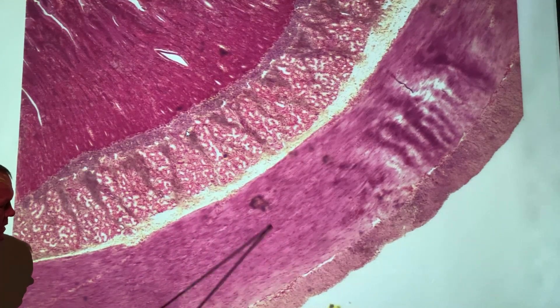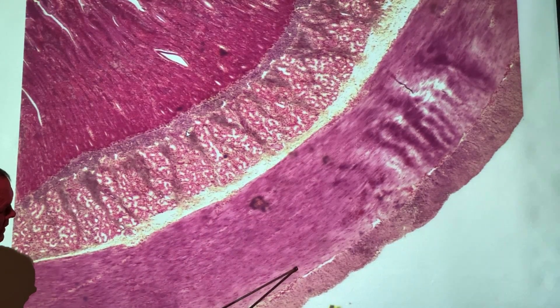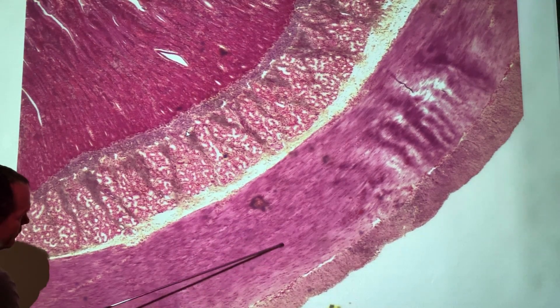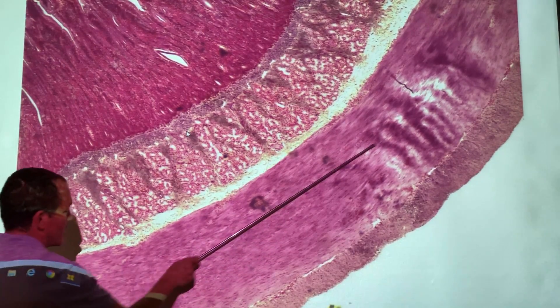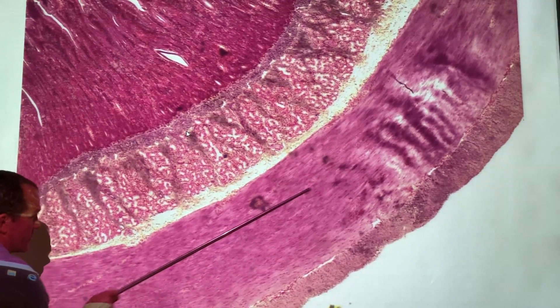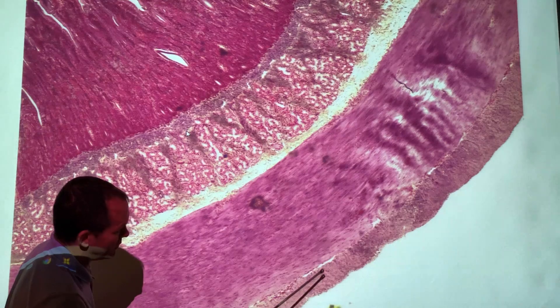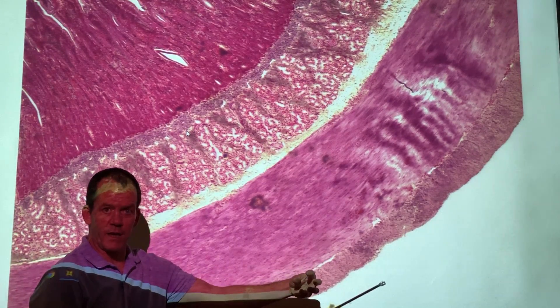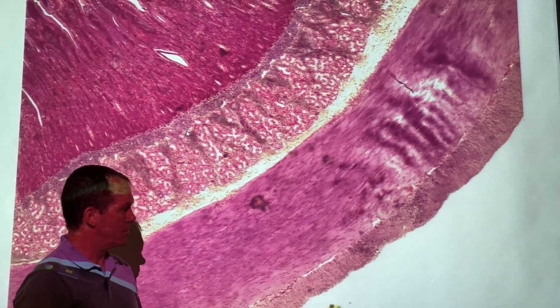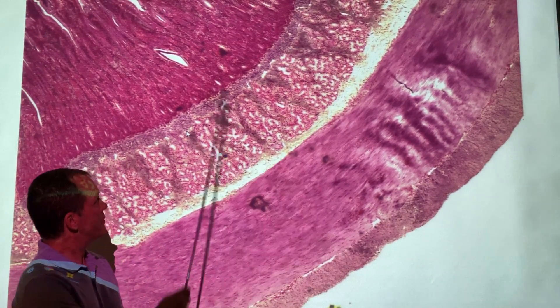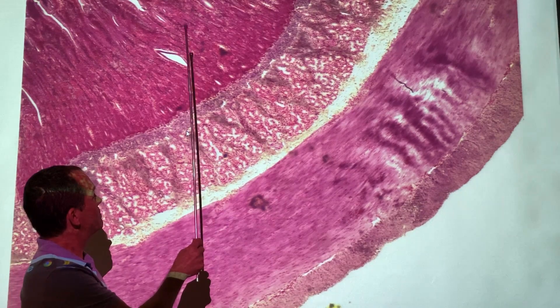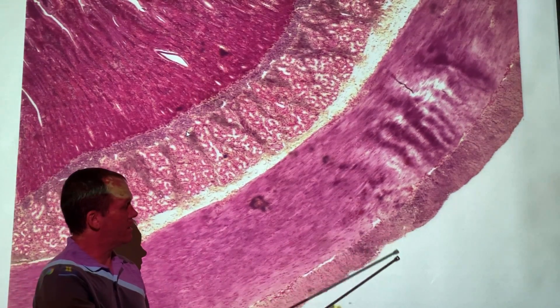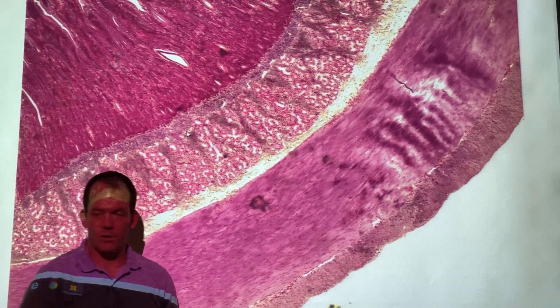Then we move out to the muscularis layer. You can see a circular layer right there — the fibers are clearly running this direction — and these fibers out here are clearly running towards us again. So circular, longitudinal tunics. To summarize the layers: mucosa, submucosa, muscularis. The adventitia is not shown on this one.